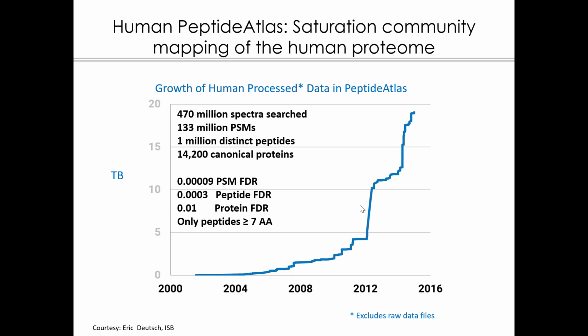Okay, so I come to these two questions now in the following. Here is simply an indication of how rapidly this field has evolved. In 2000 or even 2005, there was almost no data generated by current standards, and all these data were generated incidentally by data-dependent analysis, shotgun proteomics. Then we started a project which we call the Human Peptide Atlas, where we asked people out in the field to collect data, send the data over when they publish a paper, and we would do an aggregate analysis.